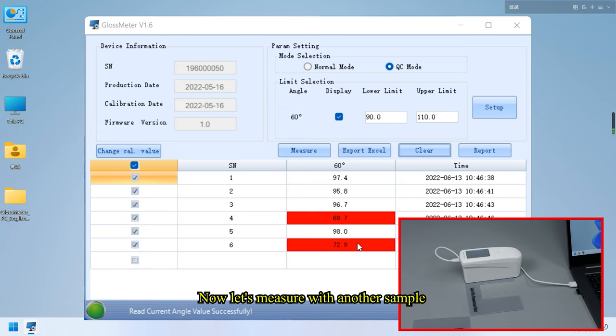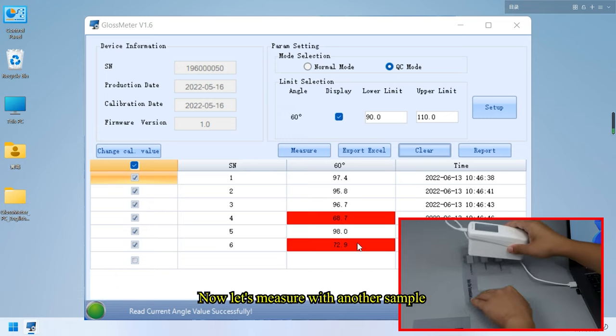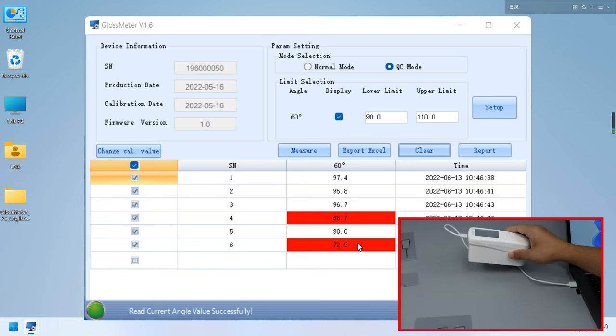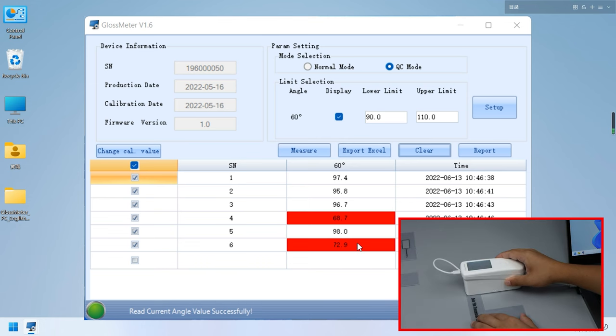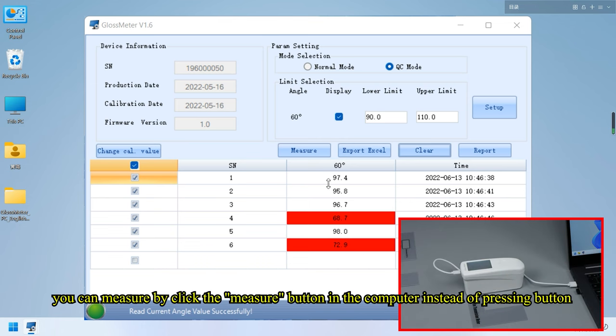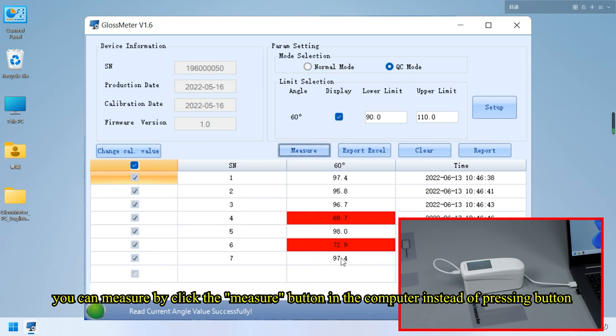Now let's measure with another sample. You can measure by clicking the measure button in the computer instead of pressing button.